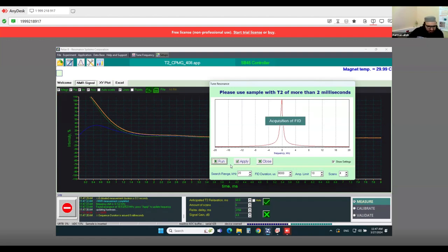Like before, it is approximately in phase, at 18.53 something, and it seems to be at the center.